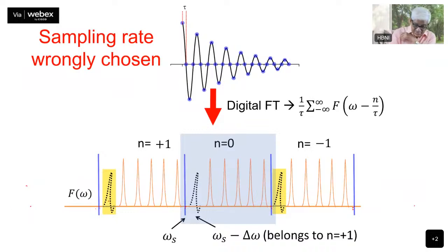From this side, because this is a positive negative frequency. The f of w is from here. Now the spectral region which is coming from here, it will produce a signal here because that is the same here. From this spectral f of w, that signal is appearing here. Okay. And from this one, it will appear here.